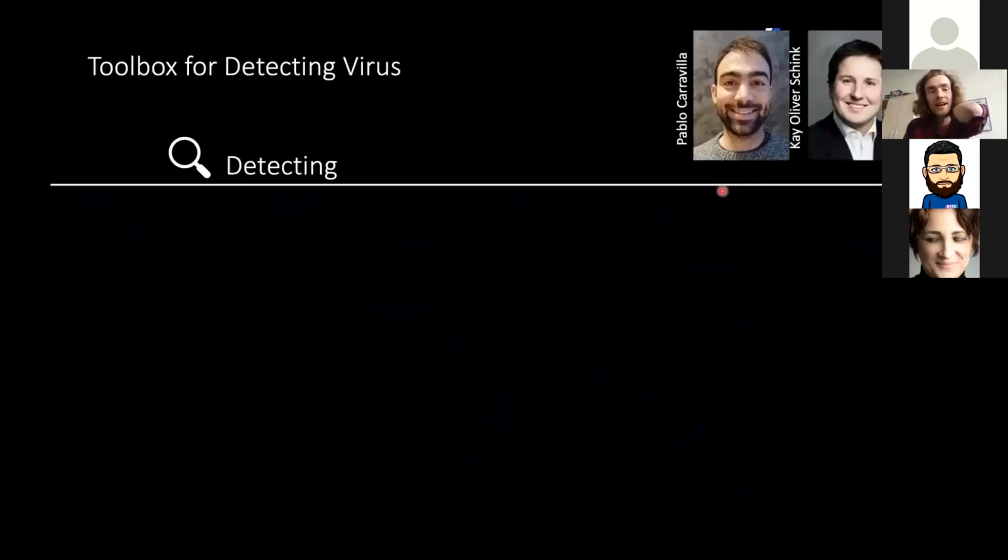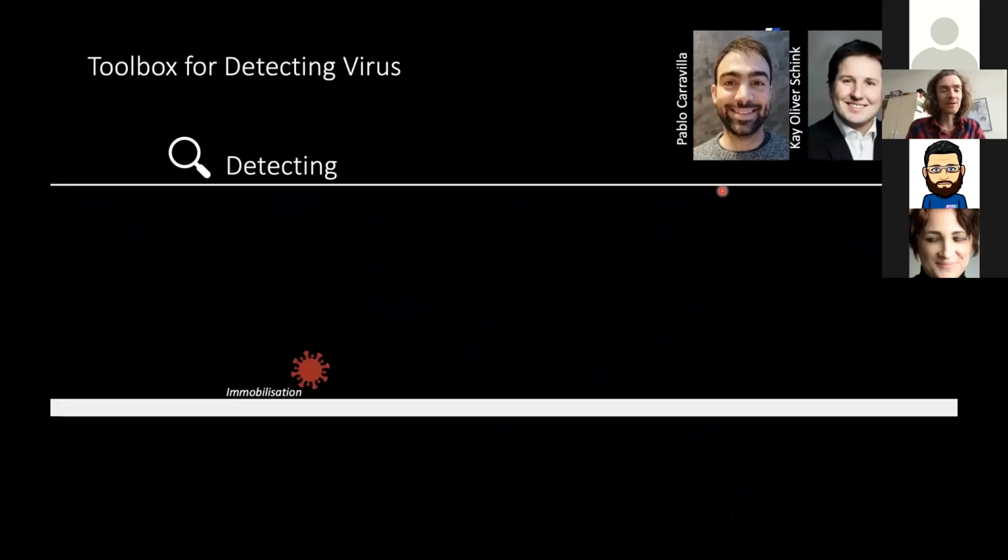And as I've mentioned, roughly a year ago, when we came back from this workshop in Oslo, the corona pandemic was basically following us. And so there was a lockdown, and I was getting quite upset because I wanted to do something. And then we came up with this idea to eventually detect coronaviruses. So, you may know that there are lots of different protocols you can use in order to detect it. Immunostaining is one approach, and we also followed this idea.